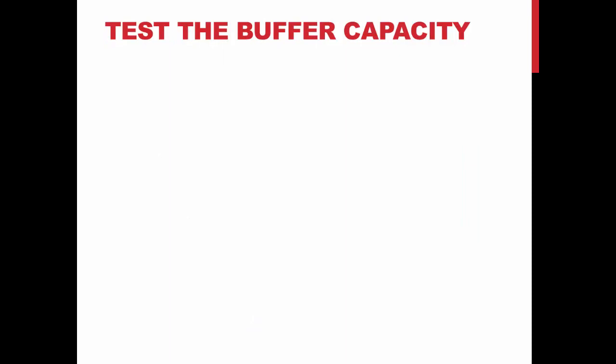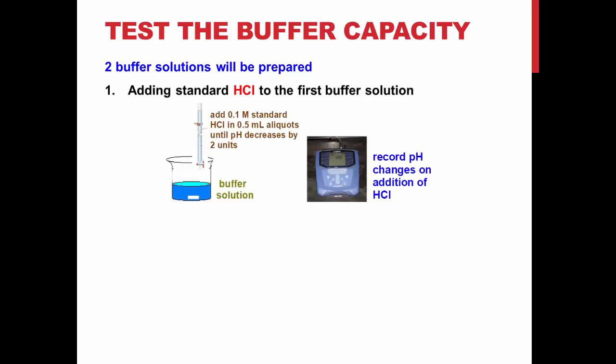You will obtain a pH meter and perform a two-point calibration. Set up a burette containing 0.1 M hydrochloric acid and place one of your prepared buffer solutions, containing a magnetic stir bar, below it.